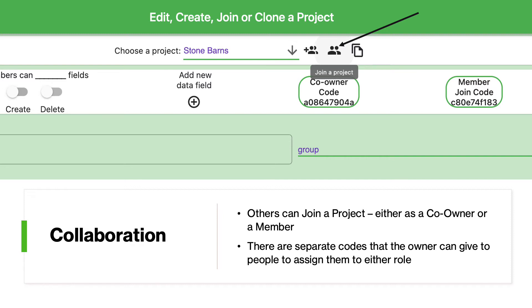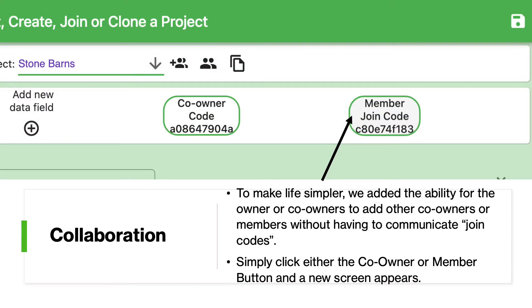These are random arrangements of 10 numbers and letters and are unique for every project created. Co-owners and members have different privileges, as you will see shortly. You can email these codes to others you wish to become either co-owners or members of the group you have created. They would then go to the project management screen, click join a project, and enter that code. The join code method of forming groups is common in collaborative academic software, where a teacher can display the join code at the front of the classroom and all her students can type it in on their classroom laptops.